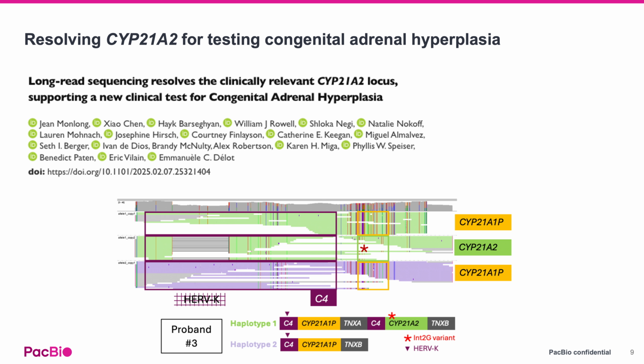green are on one allele, with 1 copy of the pseudogene and 1 copy of CYP21A2, which carries a pathogenic small variant labeled by the star sign. On the other allele in purple, there is only 1 copy of the repeat, indicating a deletion, leaving just 1 copy of the pseudogene on this allele. Paraphase successfully solved this case and many other patient samples, reporting biallelic variants of CYP21A2.